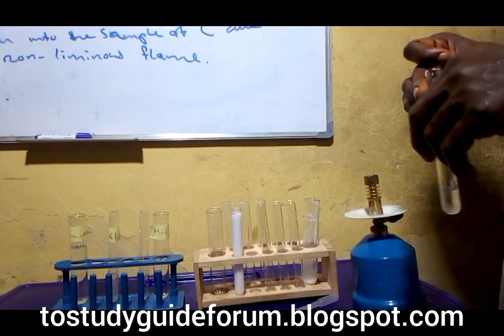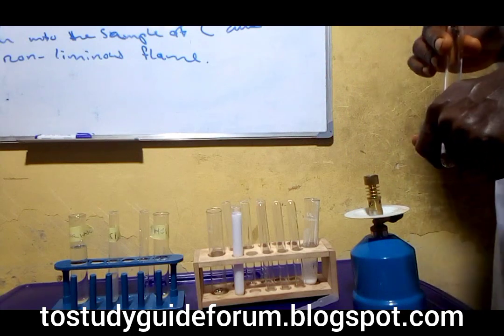So now we're going over to the next test here.